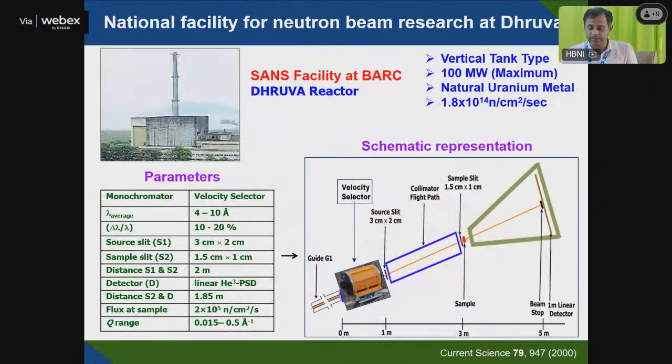And as I told you, the SAXS measurement can be done in any small angle X-ray scattering unit. There are many available instruments, like Anton Paar and some other companies, doing small angle X-ray technique based instruments. But in the case of SANS, you need a neutron source to make the SANS measurement possible.